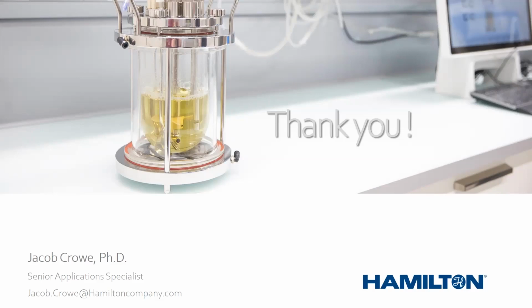If there's certain caveats to the 90-degree turbidity system, then those caveats might not be reflected in the Dencytee Arc system. Yes. So yeah, sorry, I can't fully answer that one. I don't have too much experience with the 90-degree turbidity system.